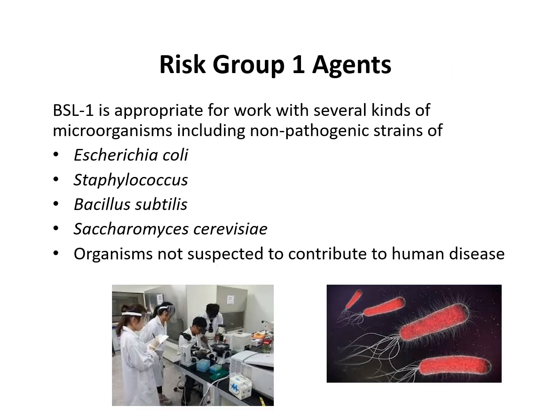So what pathogens fall under this BSL-1 level? Mostly, as I mentioned before, microorganisms that don't have the potential to cause disease fall under BSL-1 labs.